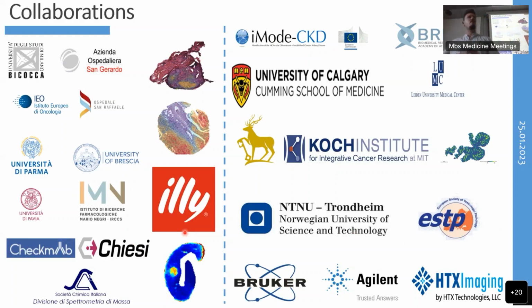And in particular, we focused on the detection of chlorogenic acids, for example, and hopefully in the next 6 to 7 months, a nice article regarding this will come out. In addition to a national level, at the international level, we also have a number of ongoing collaborations. We've recently started collaborating with the Koch Institute at MIT, where we're using our spatial lipidomics technology to try and detect differences in HIV positive patients.